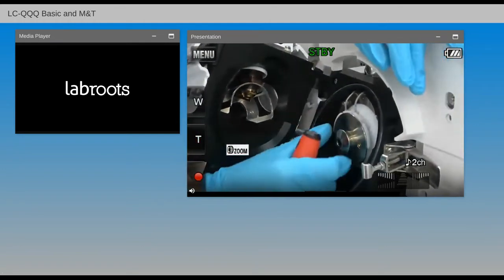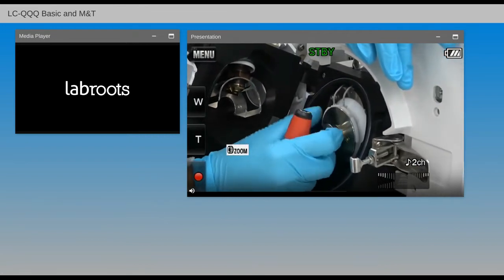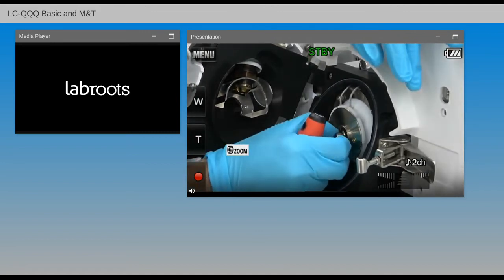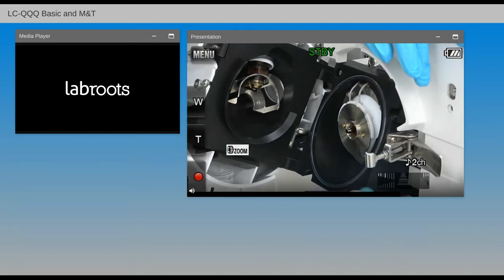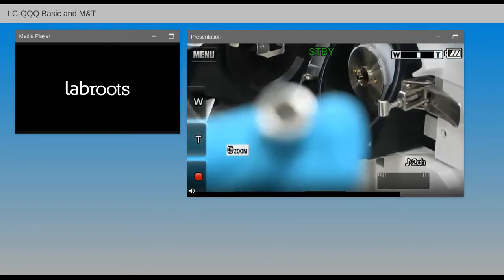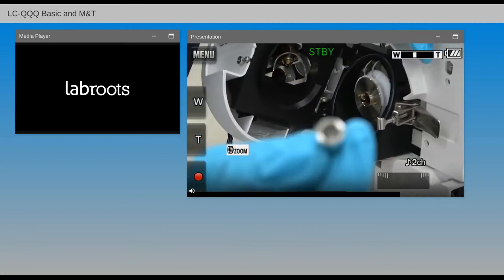So right now, I'm going to remove the spray shield from the spray chamber, and you can see that there's a capillary cap. Let me put it closer to the monitor, the video itself, so we can do some fine tuning.